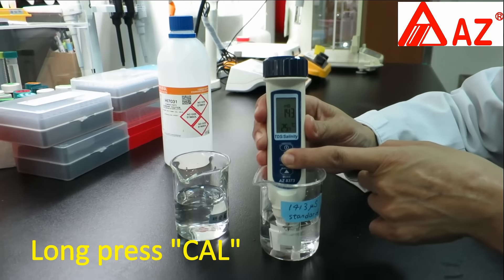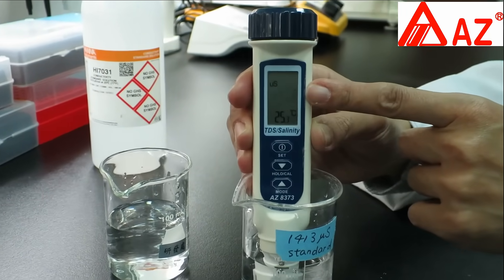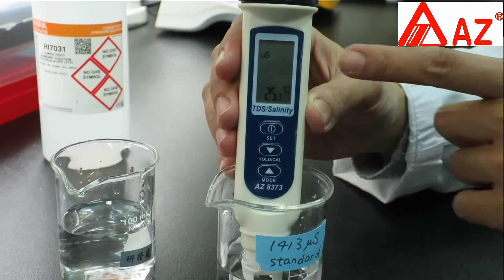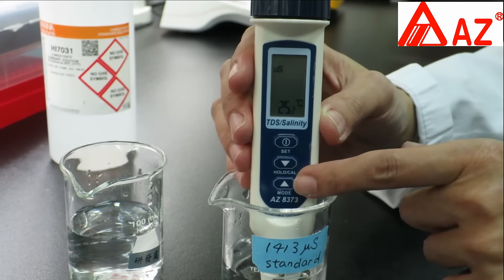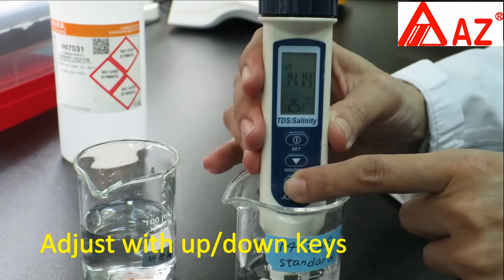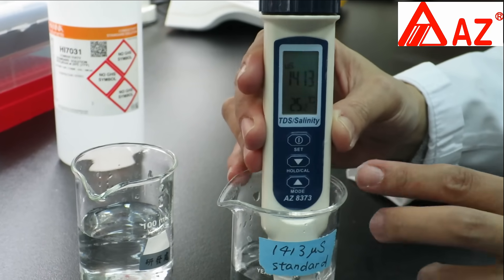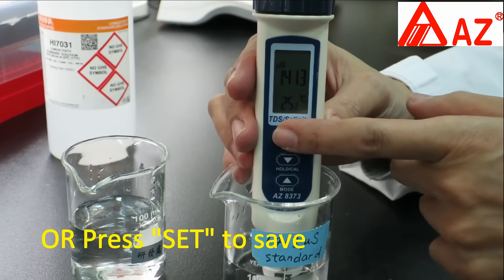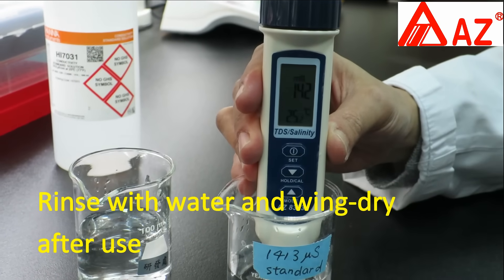Long press CAL to enter calibration. The water pen will automatically detect the value. You can adjust the value to match the standard using the up and down keys. Press SET when the reading is stable, or wait for SA to appear and return to measuring mode. Always wash with clean water after use.